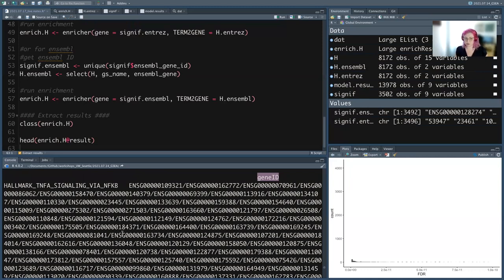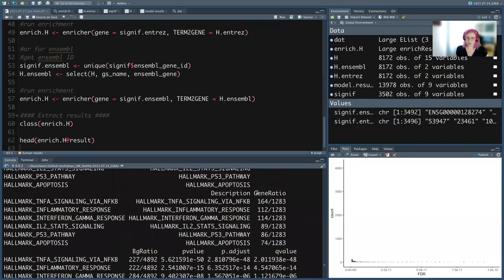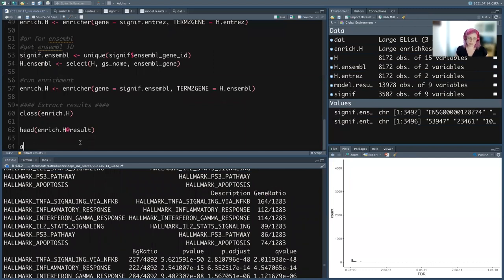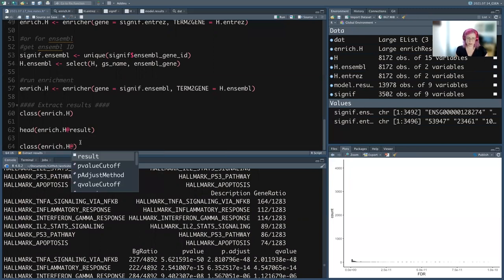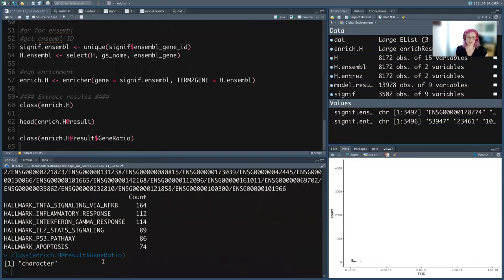The ratios are stored as character strings — R reads them as 'number/number'. If it saw them as numeric, it would turn that into a decimal. So we're going to do some formatting to make this much easier to plot. I'm going to copy this from the notes — we're pulling out the result table, taking both ratios and splitting them into two columns so they're numeric data, giving them readable names, where 'term' is the gene set like adipogenesis and 'category' is Hallmark. Then forcing them all to be numeric and calculating the K/K ratio — how many significant genes are in the gene set relative to how big the gene set is.